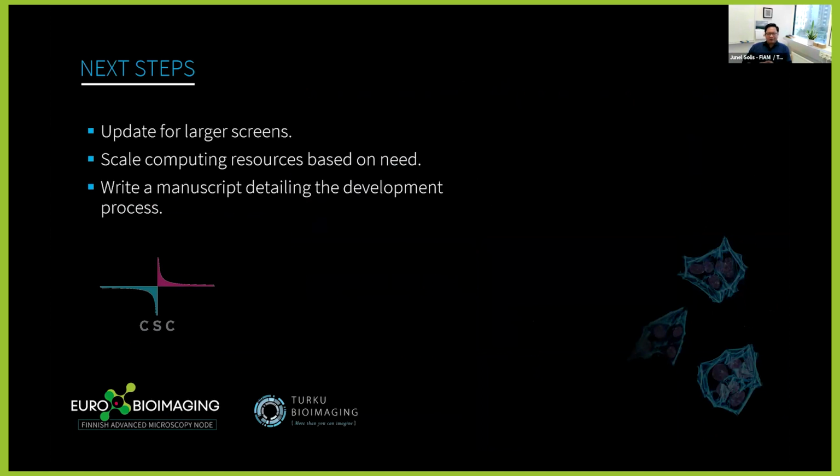In the coming days, we will update the server, so then people can start to use it on their desktop computers or laptops. But the important part here is now that it's free to use for everybody at the moment. You can go in, upload your DAPI stained image of a mouse testis cross section, and then that will make a prediction for you.